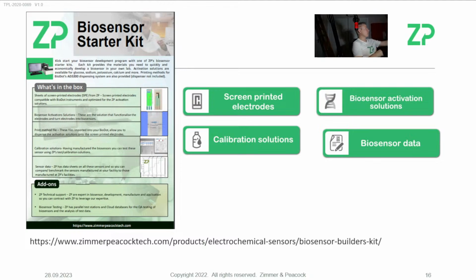That's because we were intending for people to have a liquid handling robot. These liquid handling robots cost between €50,000 and €100,000. So if somebody has a liquid handling robot, then the kit makes sense. Otherwise, I would not start by buying a robot. I would start by doing hand fabrication, because if you do it by hand, you can understand the process in your own mind, and then it will give you an idea of what robot to buy.